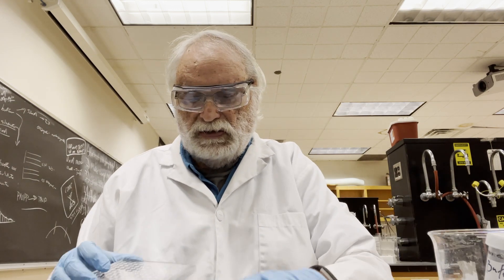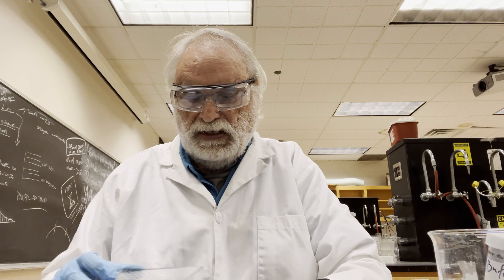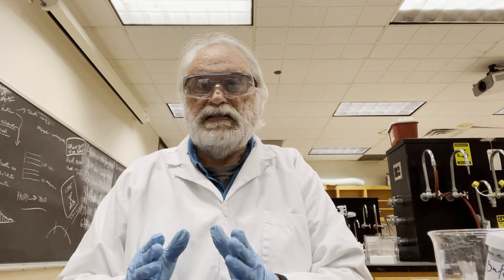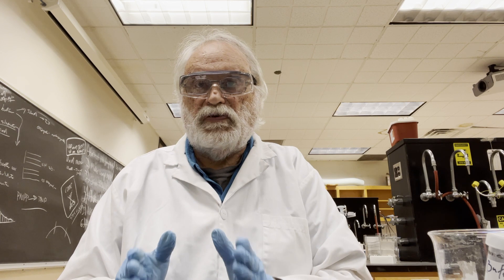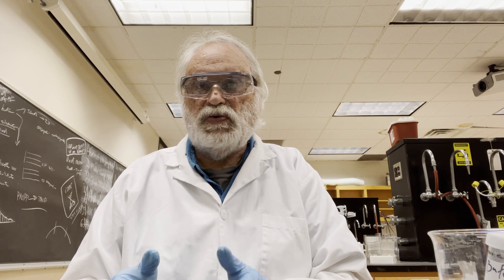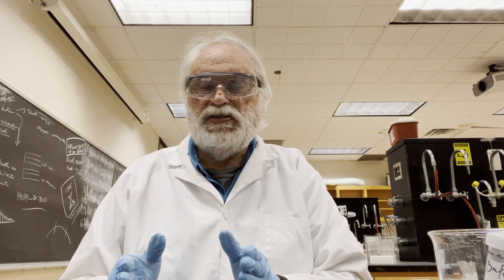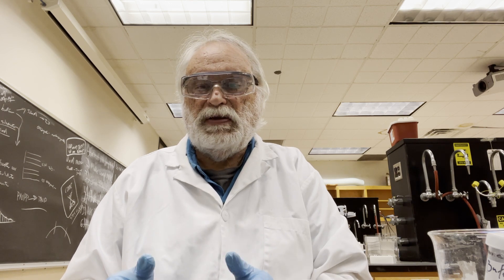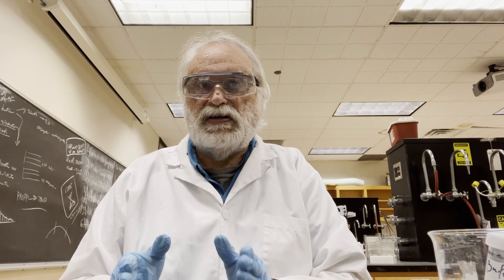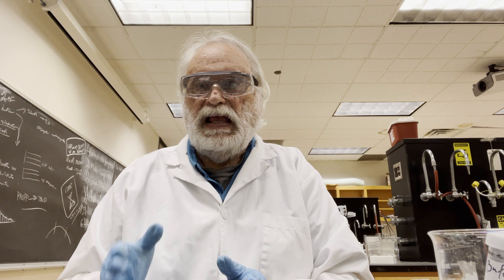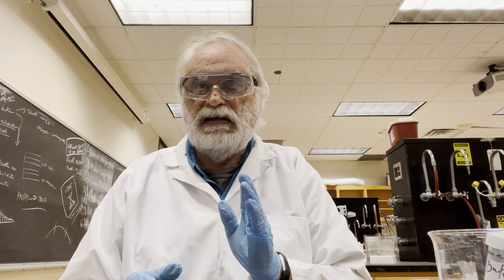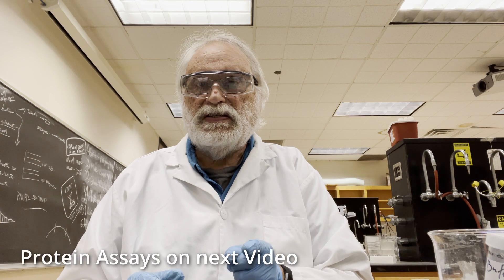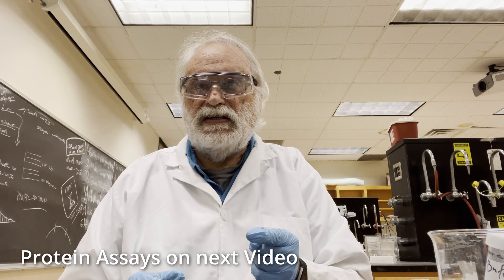So I've now added 200 microliters across all the enzyme wells. Put the lid on the plate and let these incubate for 20 minutes. After about 20 minutes, bring the plate to me or the TA and we will read it in the plate reader for you. Set your timer for 20 minutes and send it to the reader. I'll be back in a few minutes and we're going to go ahead and do the protein assays.